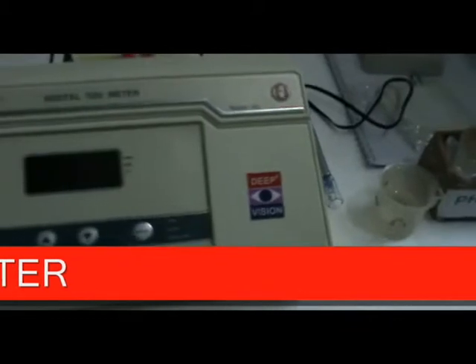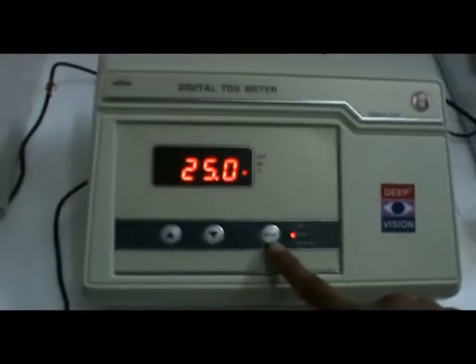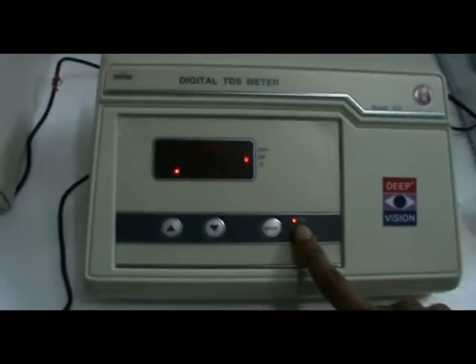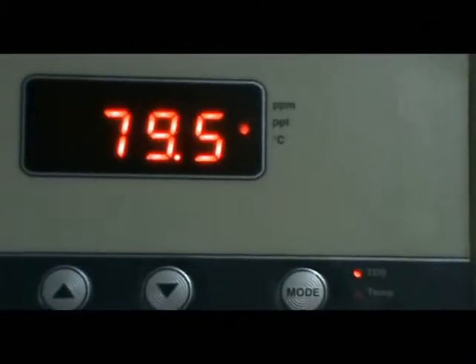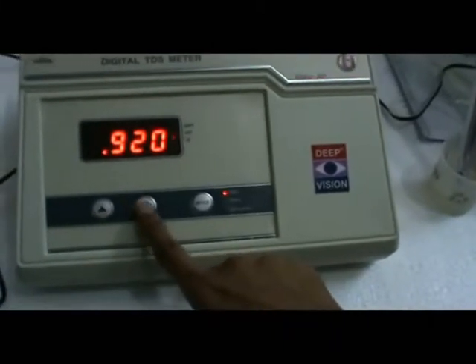Switch on the instrument. Press the mode key to select the TDS mode, then dip the TDS cell in the standard solution for calibration.